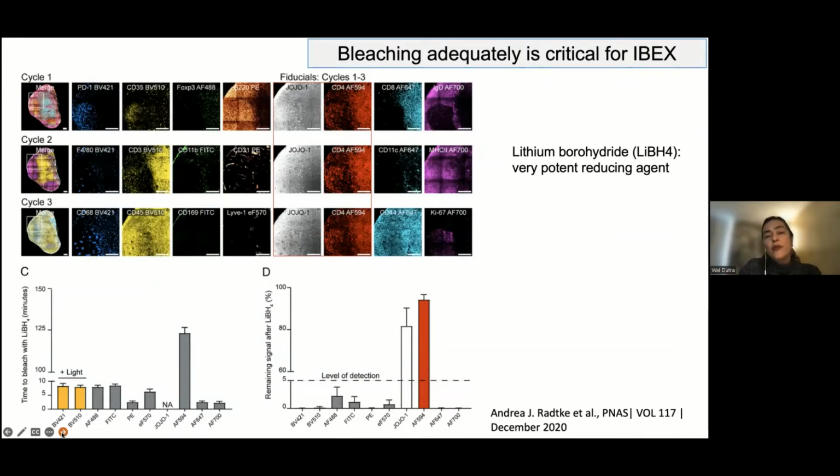If you have a confocal microscope that can read 3 parameters, you can stain for 3 parameters, bleach it, do a second cycle in 3 parameters, and do it as many times as you want. If you have a confocal that allows you to read 6 or 7 or 8 parameters, you can do your first cycle with as many parameters as your confocal reads. You can then bleach your fluorochromes and come with the second cycle on top of that. So that is what is going to determine how many molecules you're going to stain and how many cycles you're going to have to do, depending on what molecules you want to do.